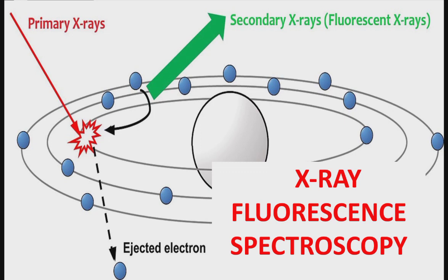And of course in spectroscopy we use different types of radiation, like visible radiation, that is light. In the recent era, spectroscopic techniques have been very refined, so their scope is becoming much broader. Nowadays it is used to examine the behavior of chemical substances also. Electromagnetic radiation such as gamma rays, X-rays, ultraviolet rays, infrared rays, radio waves and microwaves are used, and by these techniques different types of intermolecular bonding or molecular changes which occur during enzymatic reactions, the mitochondrial electron transport chain, etc., can also be obtained.